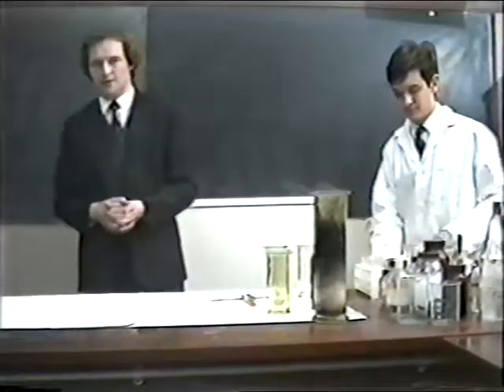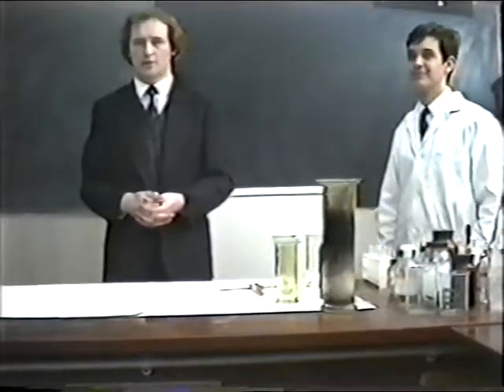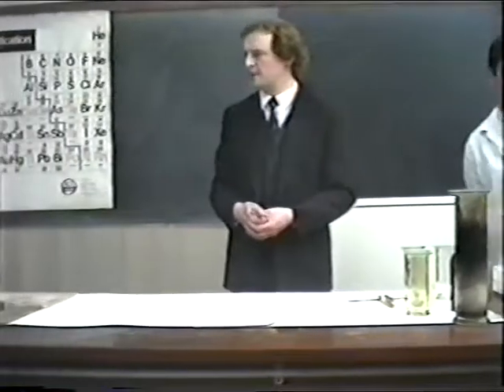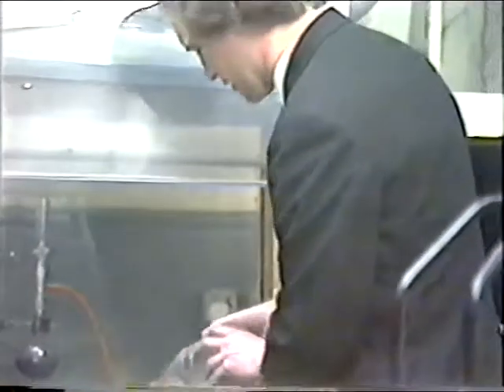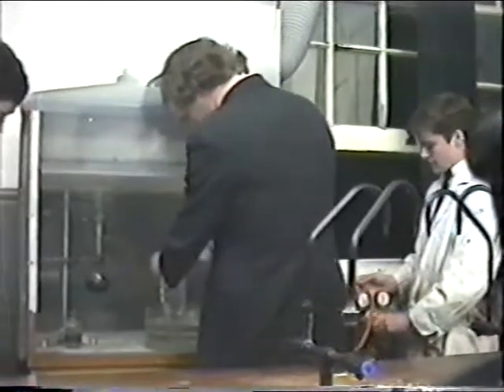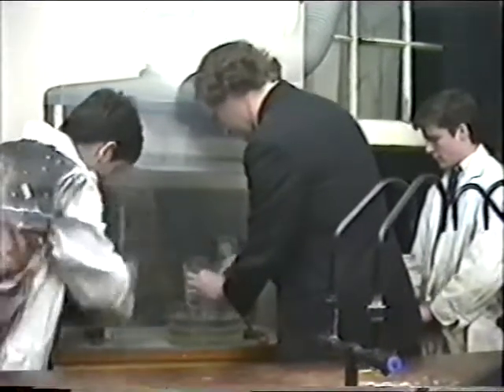For our final experiment with chlorine, I'm going to demonstrate the reaction between hydrogen and chlorine, two gases in fact. For this purpose, we are going to move over to a fume cupboard because of the extreme unpleasantness of filling a bottle with a mixture of hydrogen and chlorine. We shall rapidly fill this bottle with a 50-50 mixture of hydrogen and chlorine. Bernie, could you go past me and go over to the other side and turn on the generator? Turn on the generator.